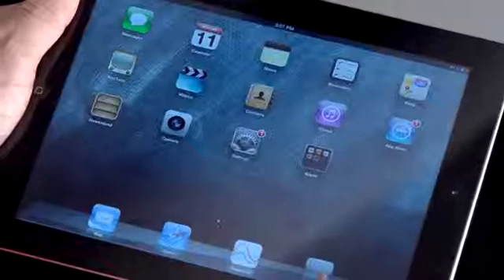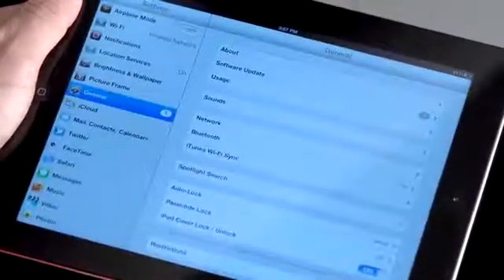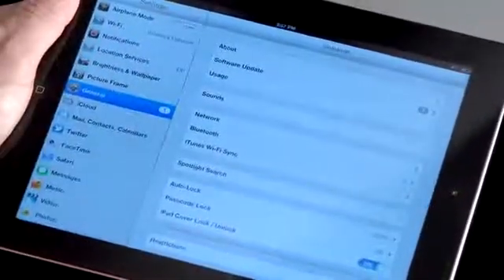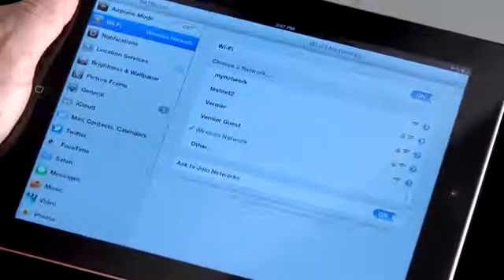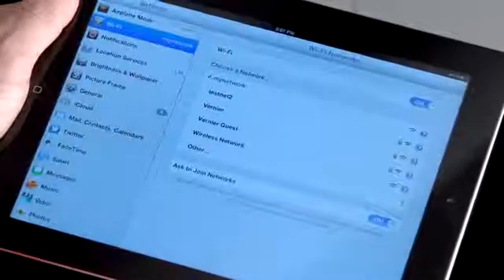Here's an iPad, and there's this section right here called Settings. And all I have to do is tap on Settings, and if I look at this location right underneath Airplane Mode, where it says Wi-Fi, if I tap there, you can see now that it sees a couple other networks. Look, there's my network. That's the network that I just created on my LabQuest 2. So now I'm going to connect to it. And there it is. It's connected. So it's connected to my network.